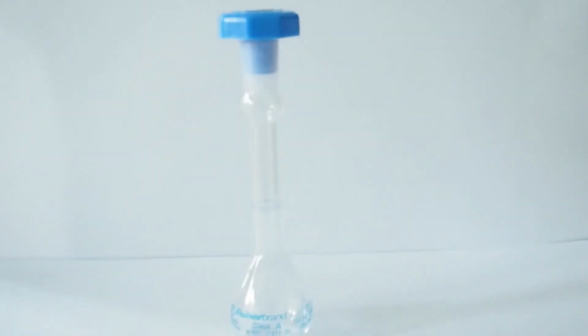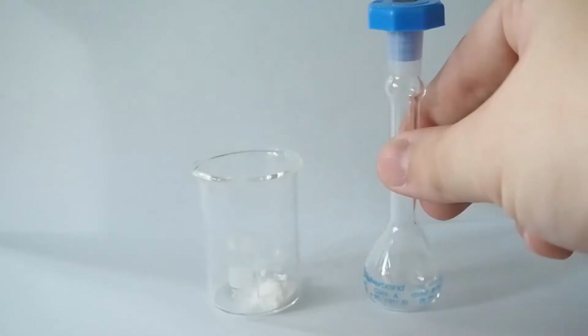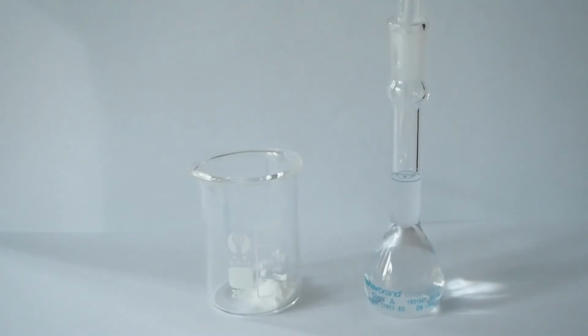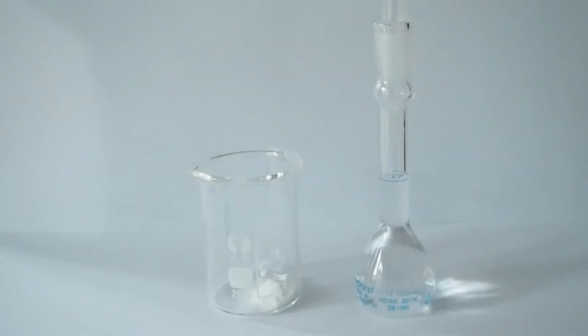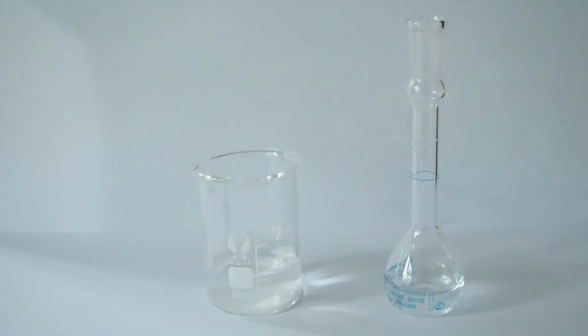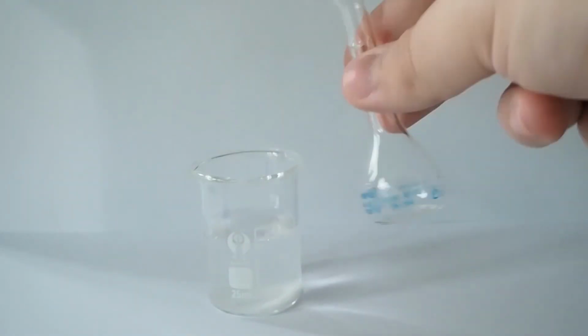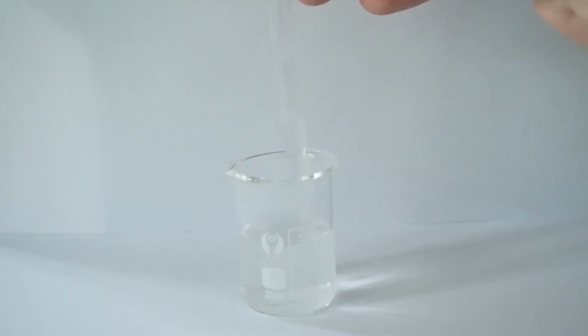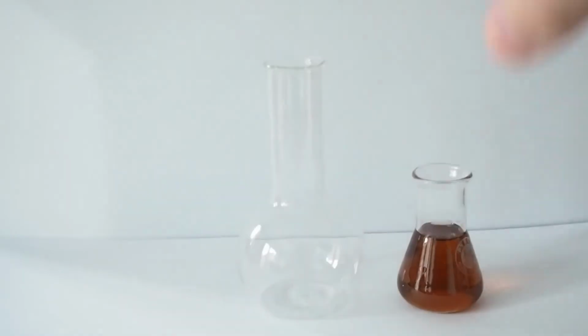And all I'm going to do is fill that up with some distilled water up to that line. Oh, got to take a little bit out. Add that in. There we go. Add that in, and then I'll do it again to give us our 20 millilitres that we're dissolving the 0.84 grams of sodium bicarb in. And that gives us our base solution, our known base solution.